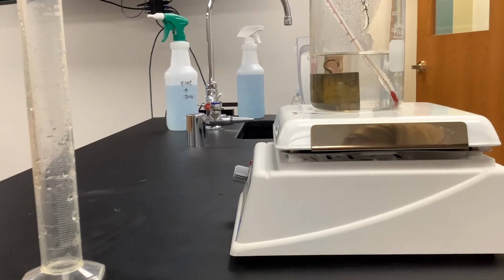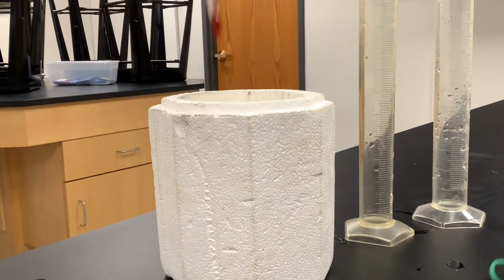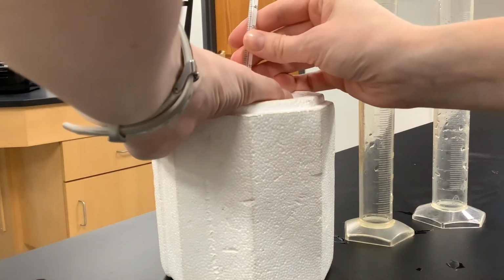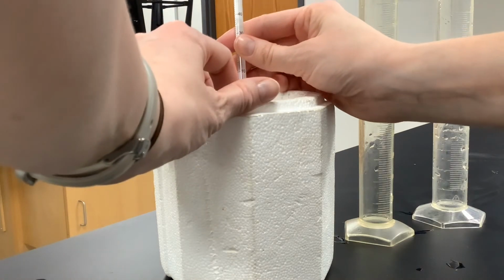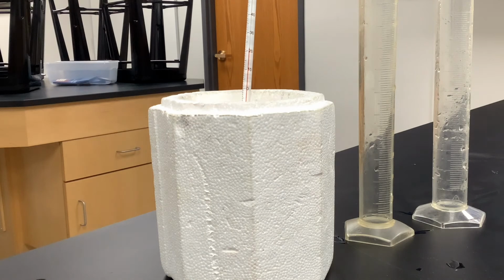Now I'm going to transfer that, move this first into the calorimeter. Put the lid on right away so it's as insulated as possible. And then we're going to wait and make sure we really are taking a good, accurate temperature, that it's not rising anymore.